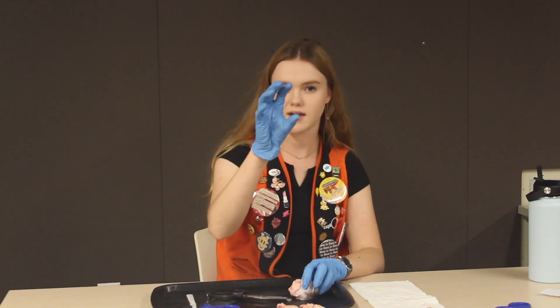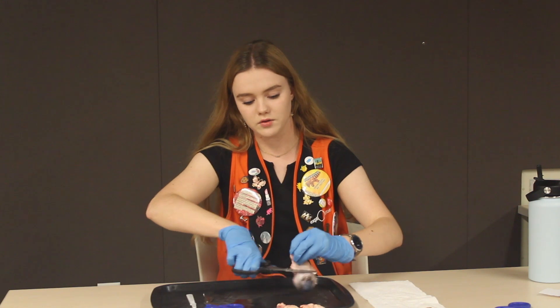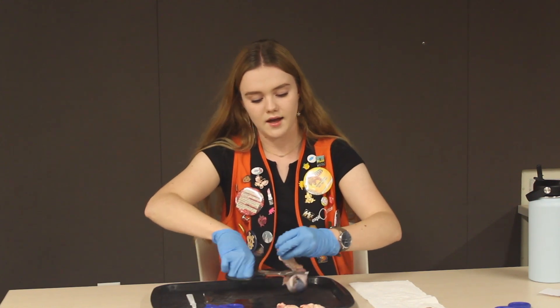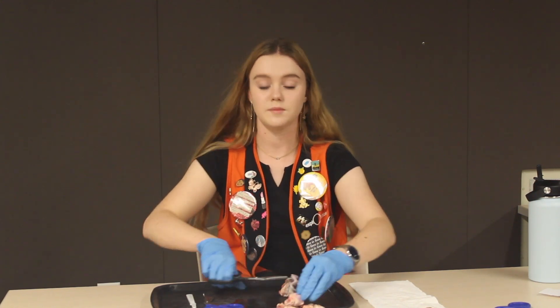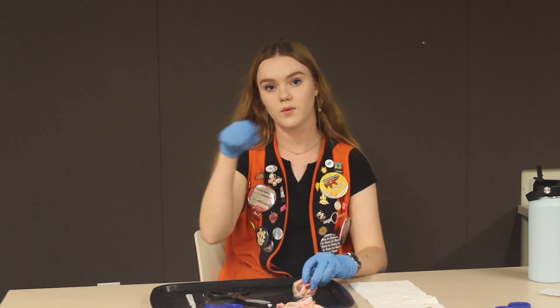Cow eyes can look up, down, left, and right, and they can also actually retract their eye just slightly so that when they're grazing in the grass they're not going to poke their eyes out. That's different from humans — humans can also look up, down, left, and right but we can also look clockwise and counterclockwise.